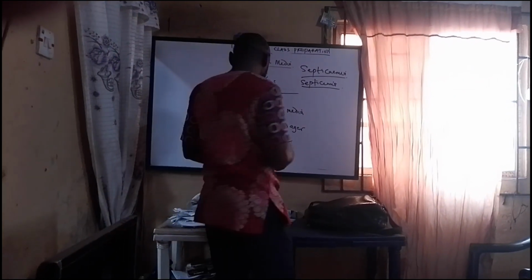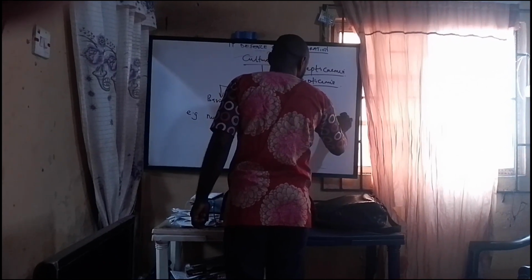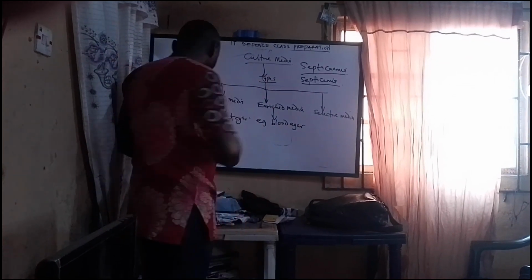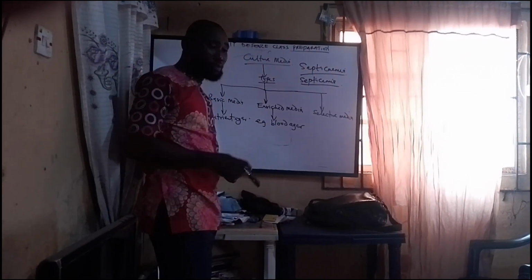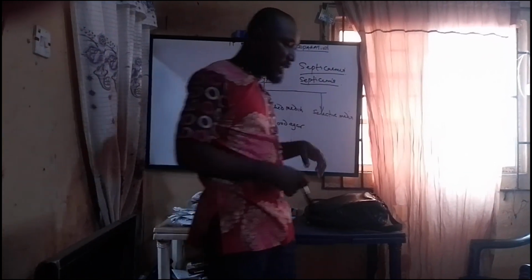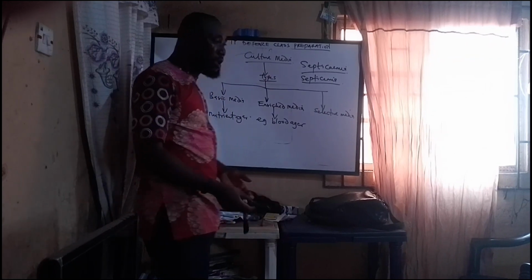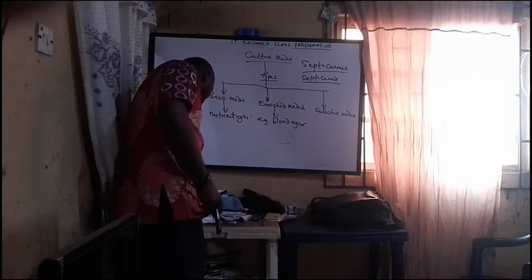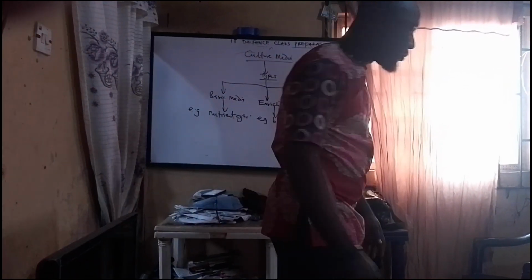Now, selective media. Selective media contains agents that inhibit the growth of certain microbes while promoting the growth of others.